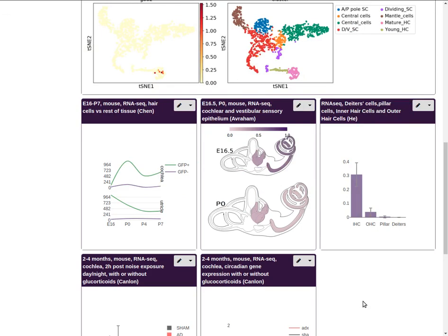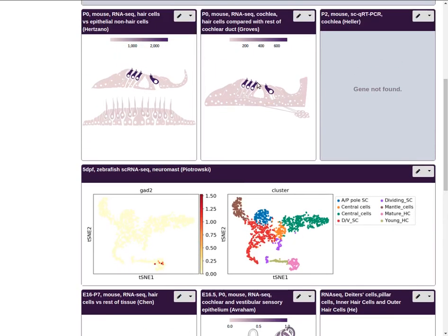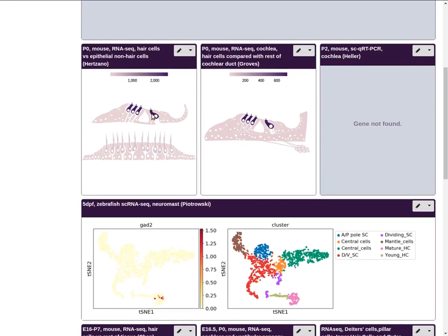It should be noted that a lot of these graphics are interactive. So from the bar plots, you can both hover over them to get the actual values, but there's also controls on the right to download the plots, to zoom or pan within them. And the same is true for the SVGs. Many of them you can hover over. Oh, I believe my screen recording software is preventing me from detecting the mouse hover. But if you hover over these normally, you can see the scores.